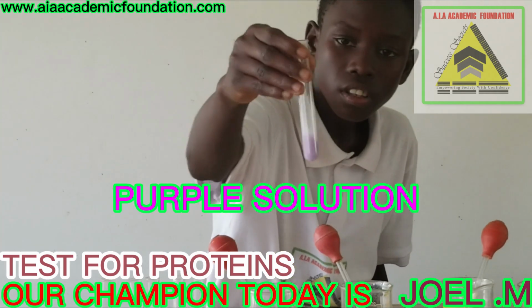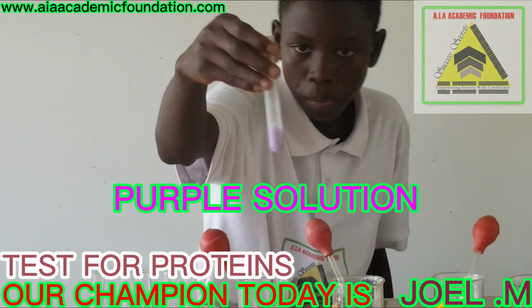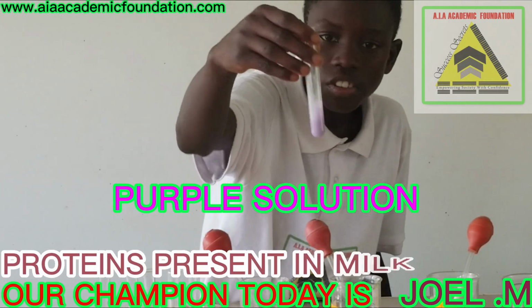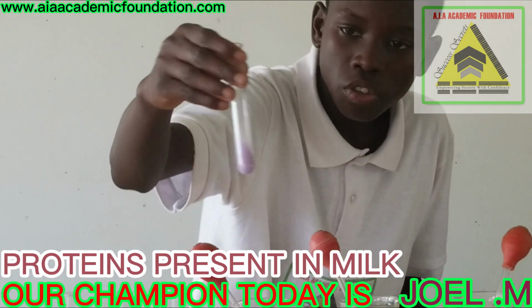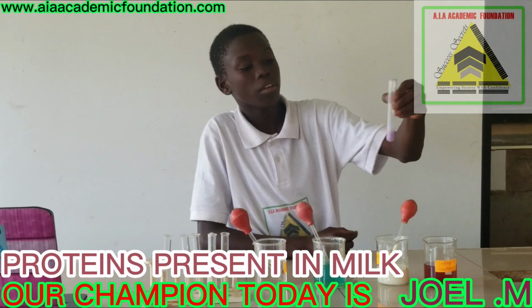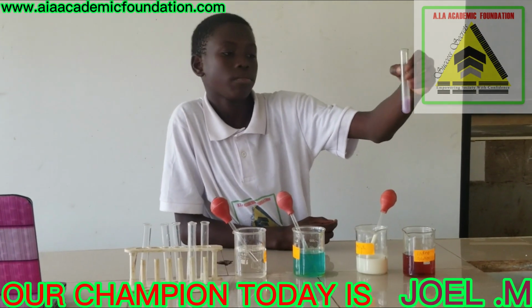You can see, once the solution turns purple, this means that milk contains proteins. And if the solution turns blue, it means that milk does not contain proteins.